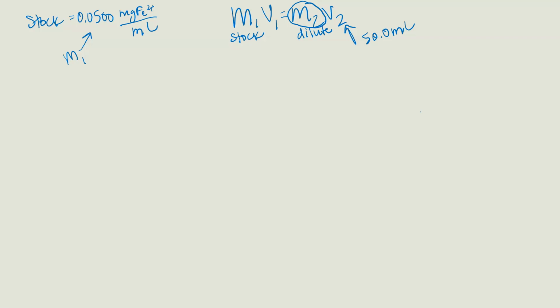Once you have that, the concentration of iron is going to be your x-axis, and your absorbance is going to be your y-axis for the one Excel graph that you're making for this lab. The Excel graph you're making for this lab is for part A. Okay. And again, concentration along the x, absorbance along the y. It better be a straight line. You will have Excel give you the equation of the line.